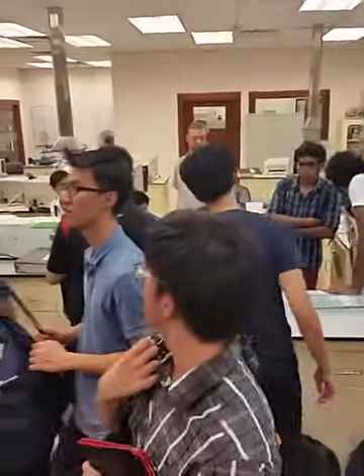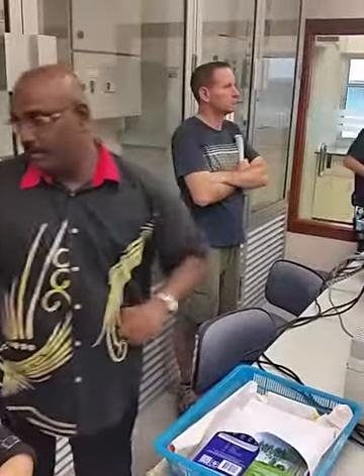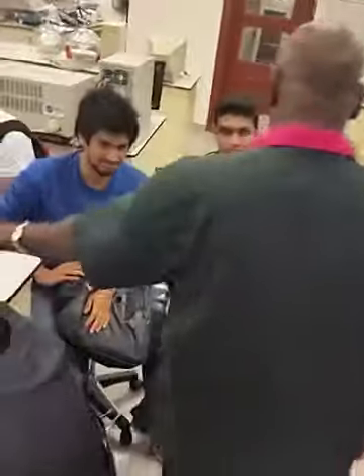This is a pH meter, where we can measure the pH directly. You can take a photo there. All the pH meters are small equipment there. The small equipment over there she pointed is a pH meter. We cannot use solid samples here, all liquid.